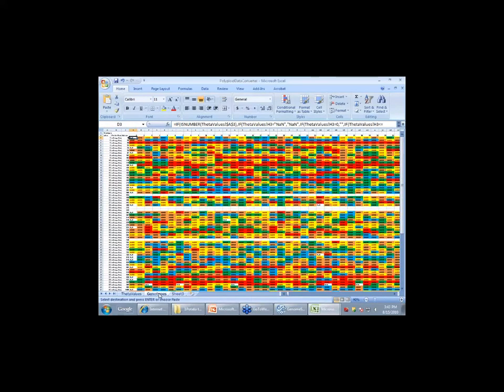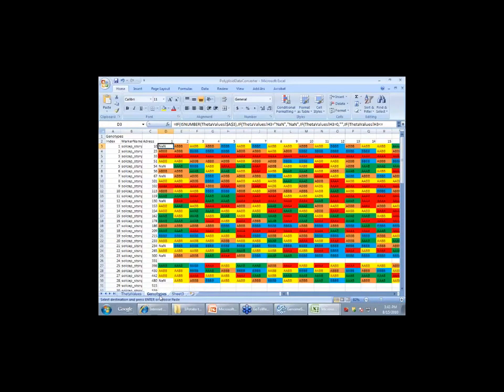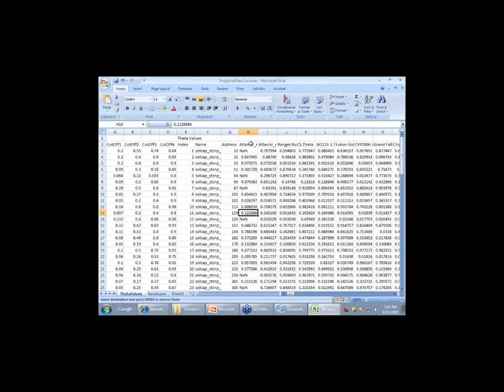If everything worked, we're going to look at the genotypes. That's your genotypes. So there's a macro that captured the genotypes, and now you can, of course, zoom in to the genotypes. So I've clicked to the genotype table, and there's a macro that captured that. Your samples in this case are only numbered in the same order that they are over here.